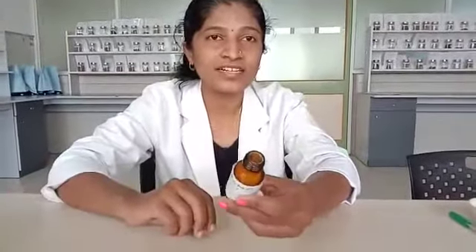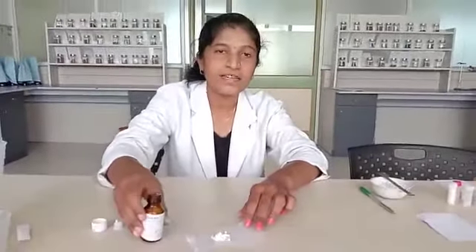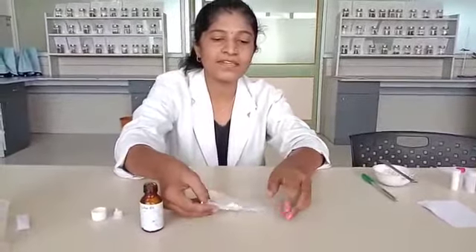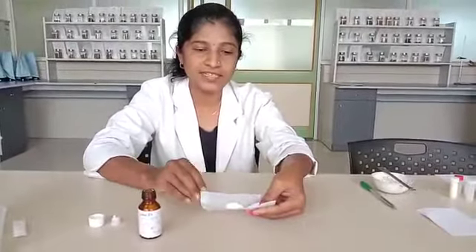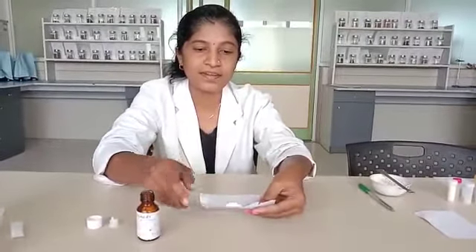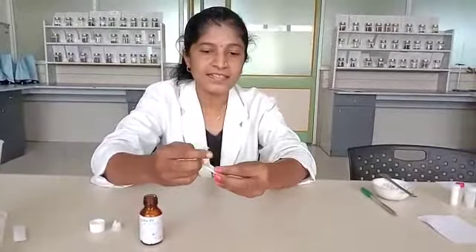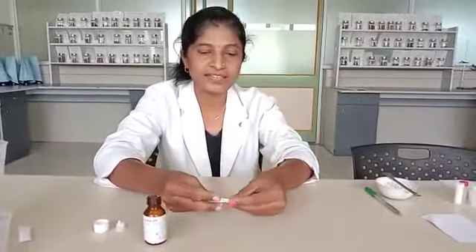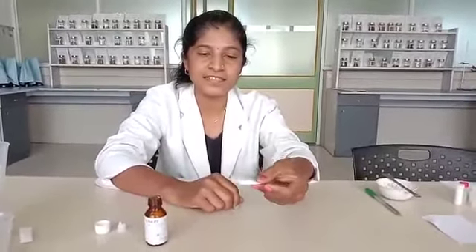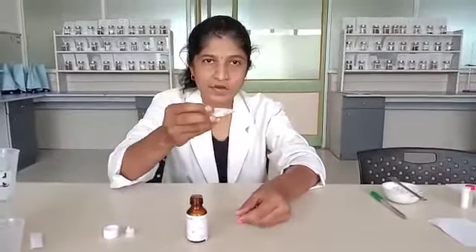Solid potency are powder triturates, available in powder form. These are dispensed singly in powder form in paper envelopes. Sulphur 6x is taken either in one gram, two grams, or three grams by weight on a butter paper, made into packets, and dispensed singly without any vehicle. The patient is asked to take the powder triturate directly on the tongue.